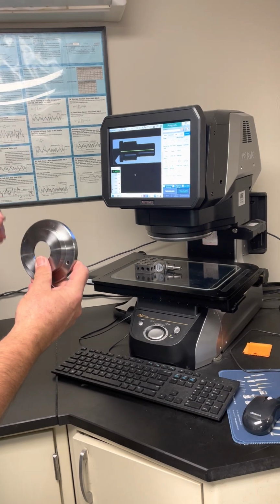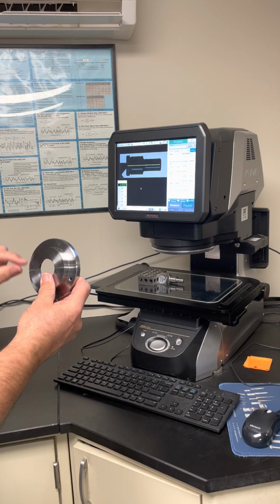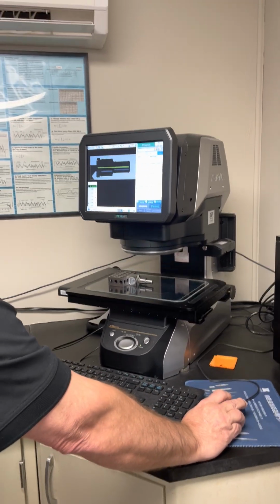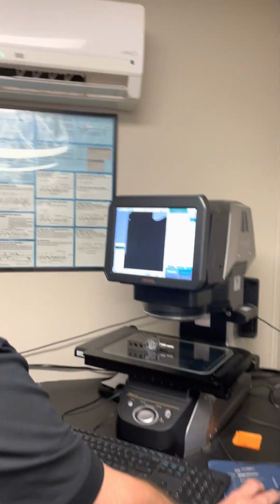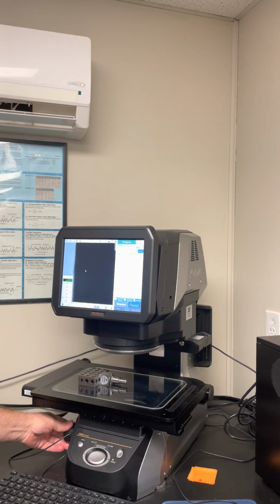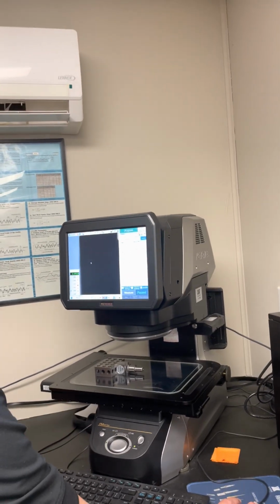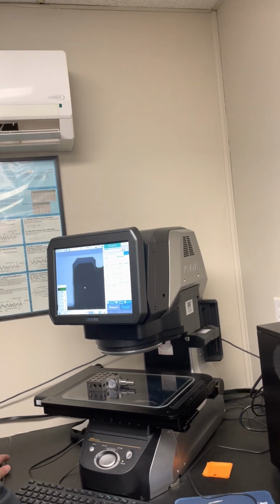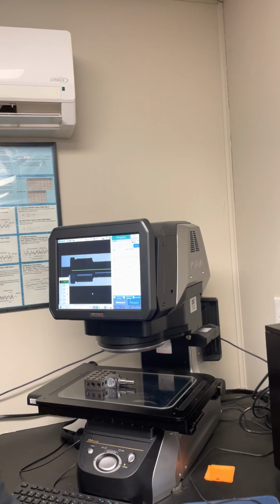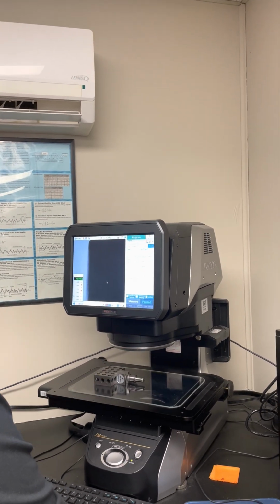Because I have a small depth of field, I'm just going to focus in on these edges, like this edge here and this edge down here. So just a small portion of it. So when I come here, I'm going to focus right in this area. Again, I can do an autofocus. So you're trying to get as close to the apex of the other diameters that you focused on to begin with. Correct. That is correct. So we should be, oh, we have to capture that image here.